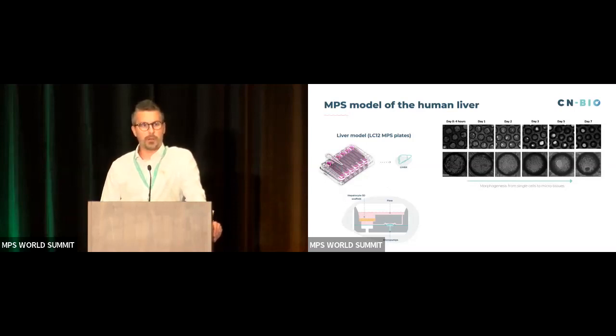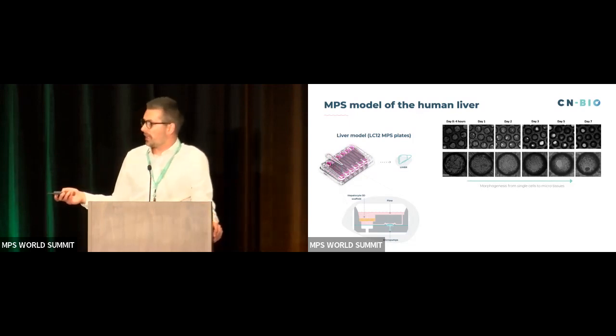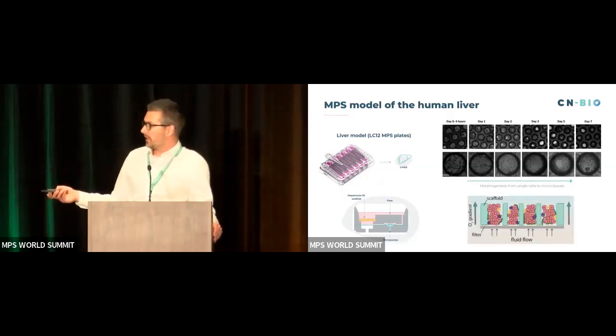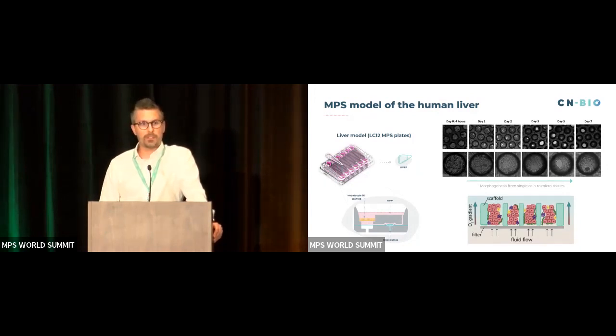These are typically cryopreserved primary human hepatocytes. They go in, and over a couple of days, these single cells form three-dimensional microtissues within the scaffold. And actually we have about 300 of these microtissues arrayed across a scaffold. So we basically recapitulate mini columns to mimic the liver microarchitecture. These can be hepatocytes, or I'll show you in a minute how we can incorporate other cell types of the liver within these three-dimensional perfused microtissues. And that perfusion of media continually through the scaffold, through these microtissues, is really key to give the cells their functionality and maintain their functionality, which they lose in typical 2D culture.